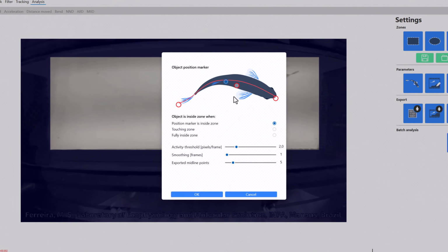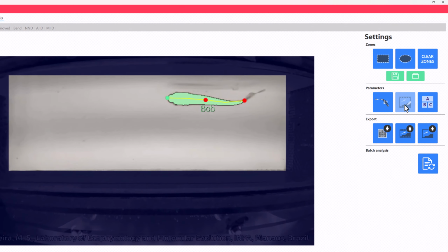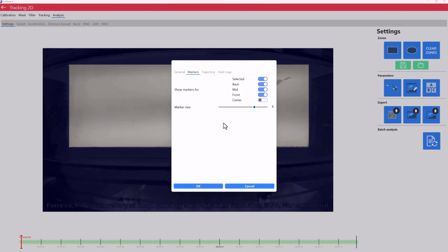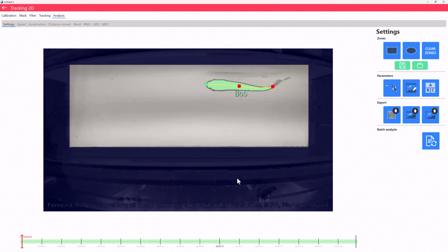And note that we can select a point here in blue, and the settings below, which we will get to in a second, apply to this selected point. But the selected point is also what "selected" stands for back in the View Settings menu. Furthermore, the selected point will be highlighted in green in the video preview and the rest in red.